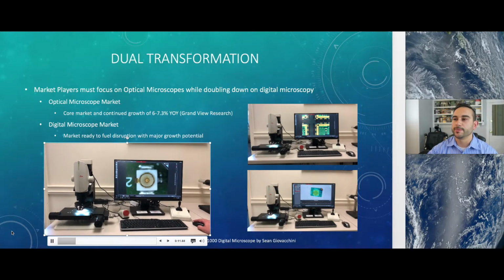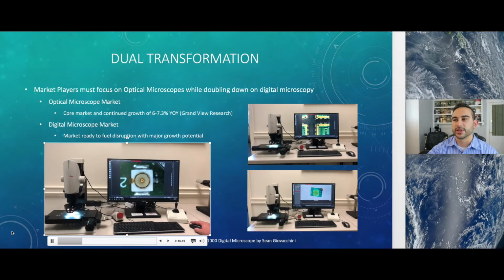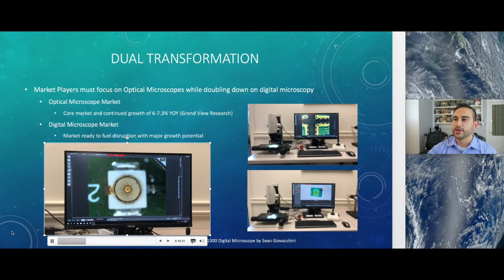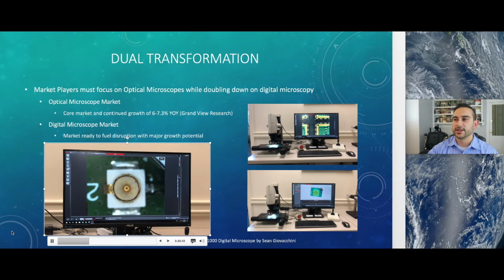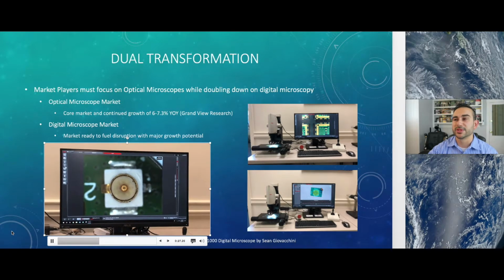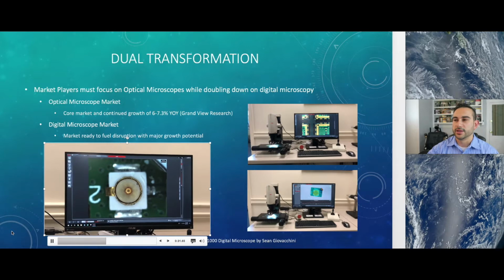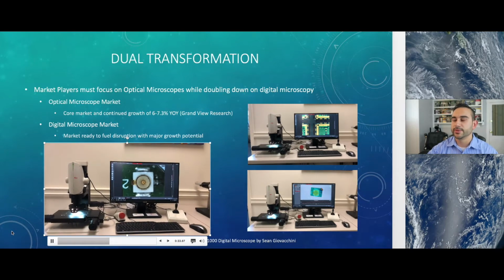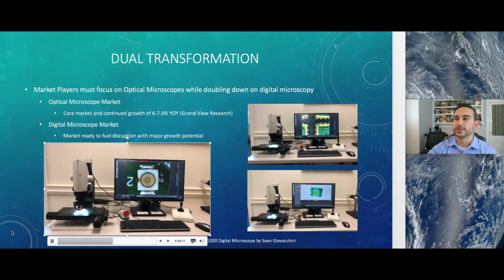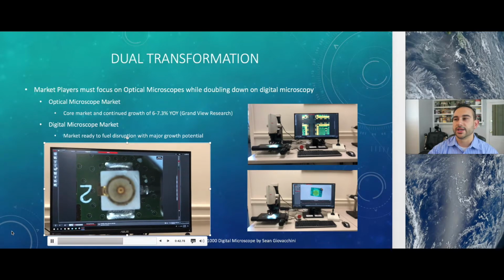So the user pressed go, you'll see the digital microscope on the left, the image in the middle. We're going to zoom in here a little bit, and then you'll see there on the right hand side that it's showing progress with a bar on the right as well as on the bottom middle. I'm going to fast forward a little bit once we zoom out here just to speed up the process of this. So now that we've zoomed out, we should zoom back in after the crop, and we will see this finish up here. So you'll see we're much further along. We're almost done here at the end.